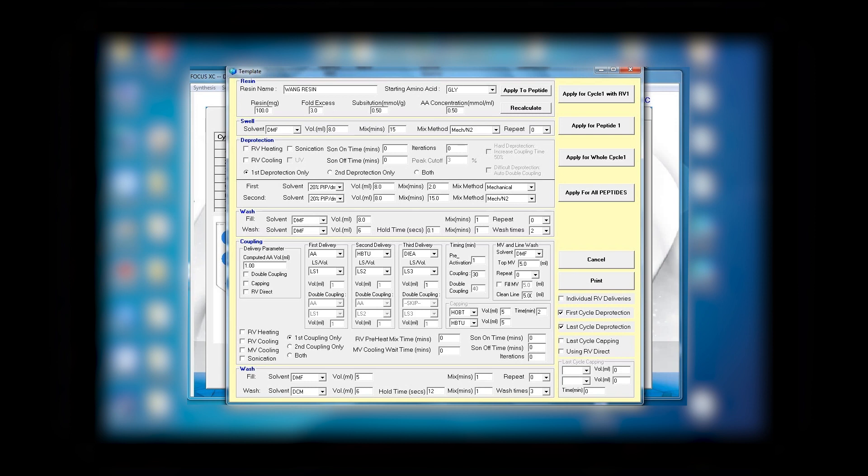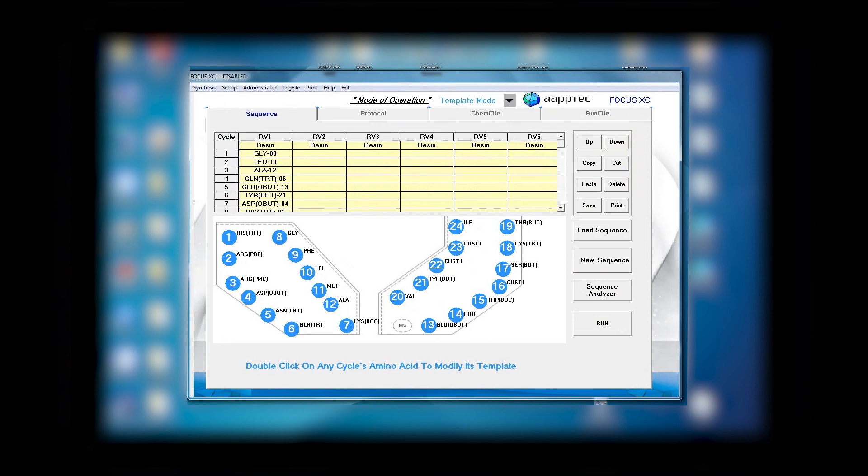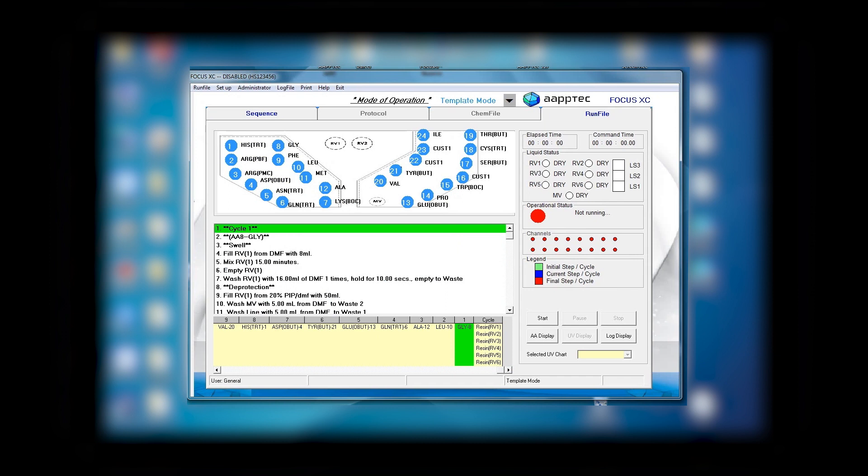Next you can see the sequence I set up in RV one, and all I have to do is save what I did and click run. By clicking run, the software automatically writes the protocol that I assigned earlier. If you look at the bottom, you can see the sequence is exactly as I created it: glycine, leucine, alanine, and it goes on.